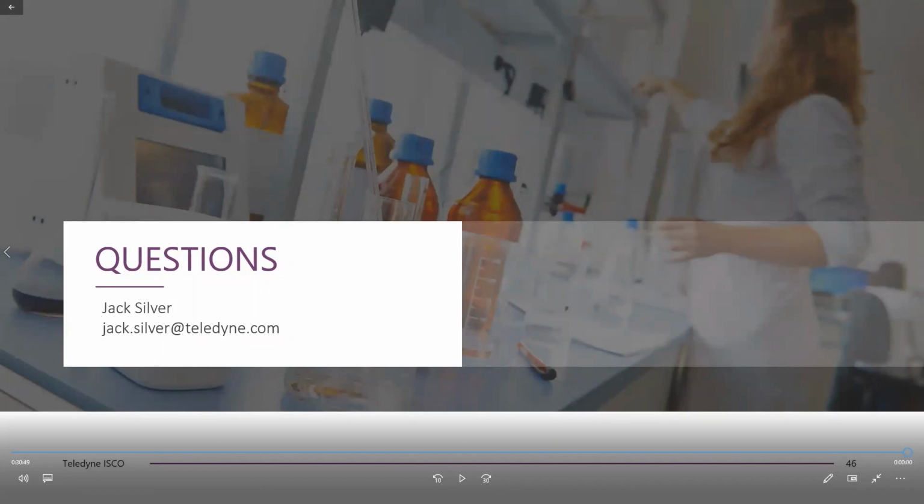For scouting methods on the ACCQPrep, if you're worried about sample loss, can you run the scouting method on a smaller column and then run the purification on a larger column? And the answer is absolutely. My preference, it works really well if I run, say, a 10 millimeter column and I only need a small amount of sample. And then when you run the focus gradient generator, you can tell it which larger column you want to use.